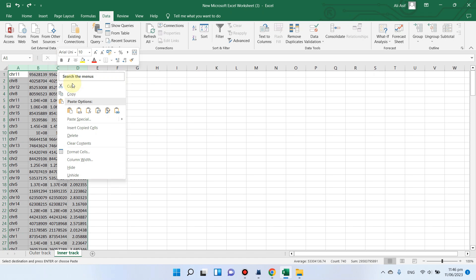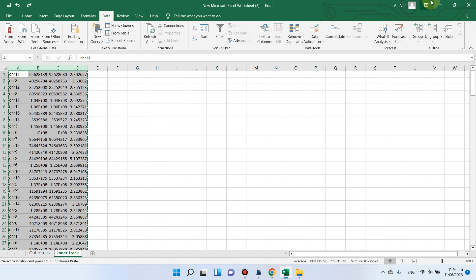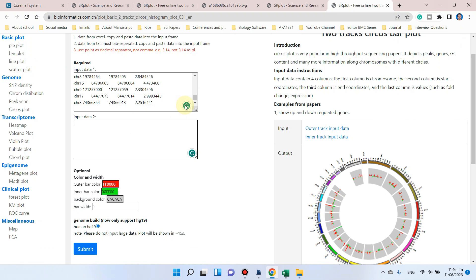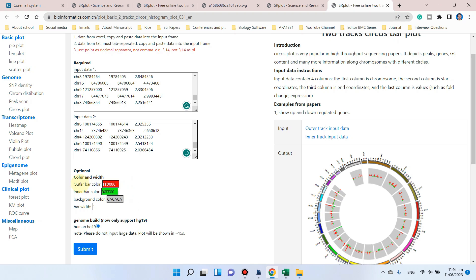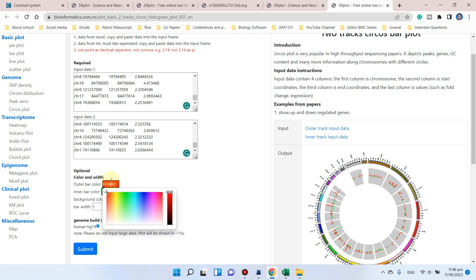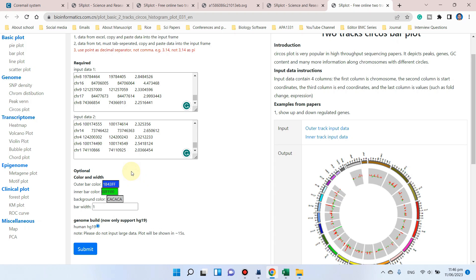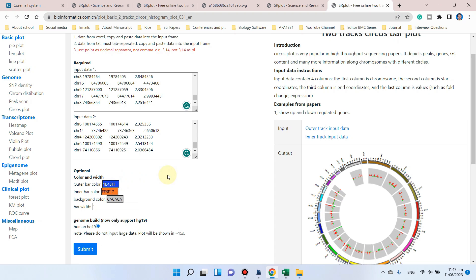You can copy all of the text without any header and paste here. Now you can see you can adjust the color and width of the outer bar and similarly the color and width of the inner bar. Let me choose a blueish color for the outer bar, and for the inner bar, we can choose red.